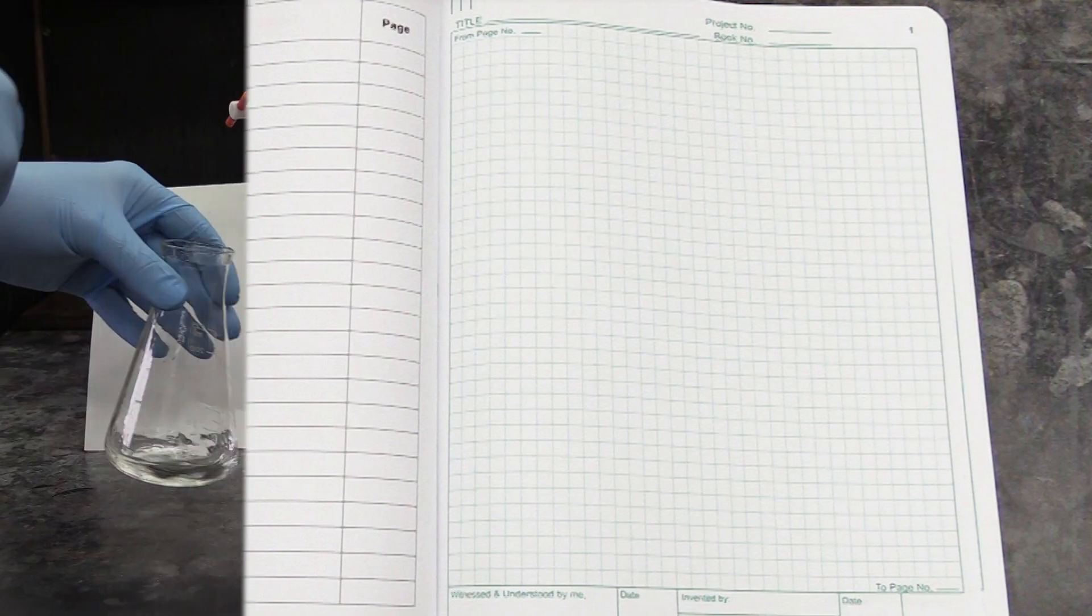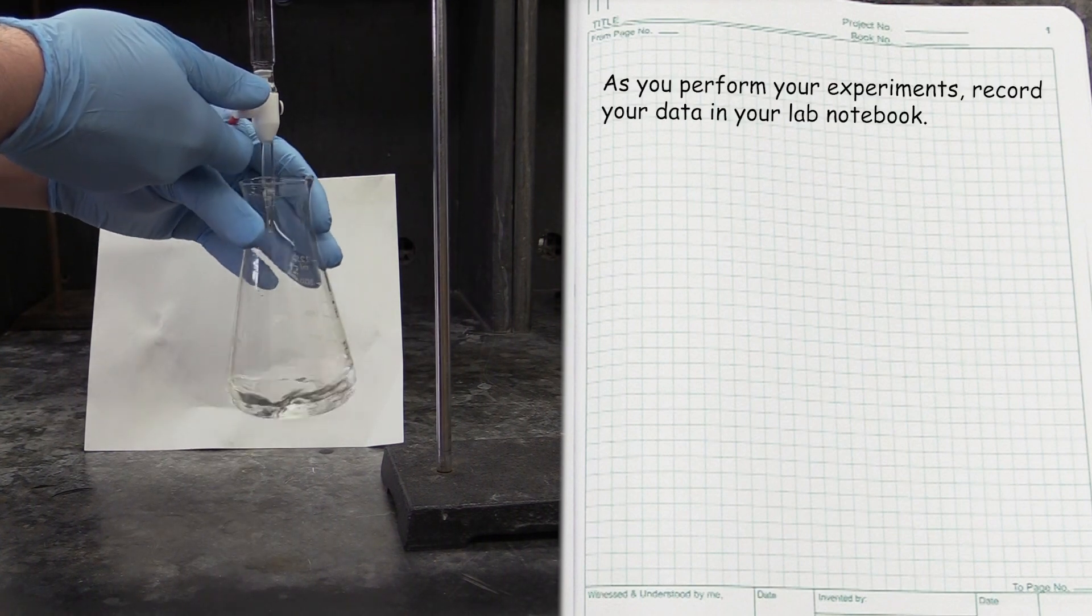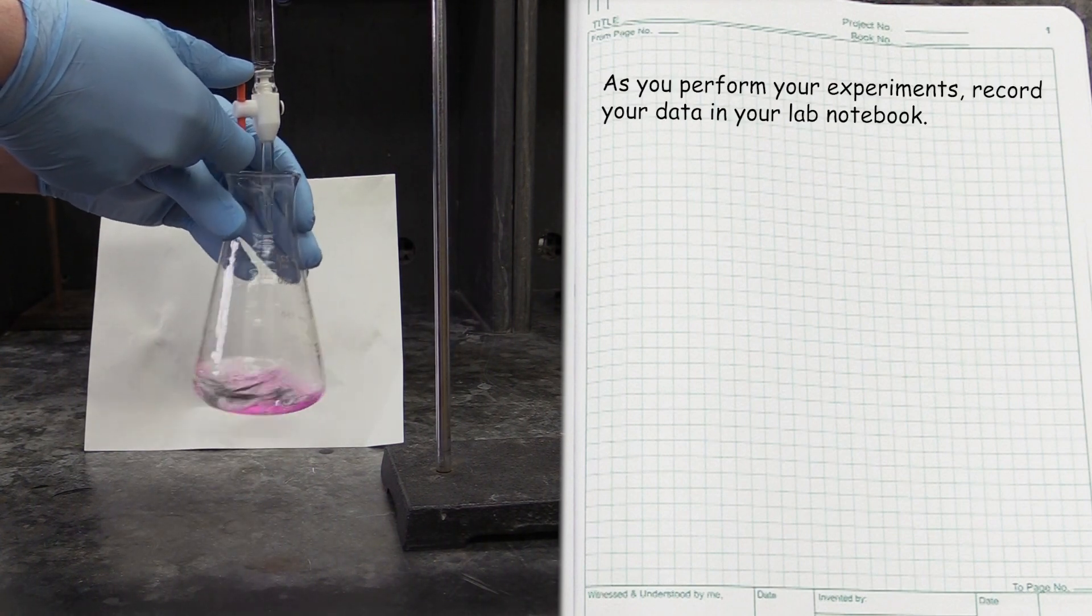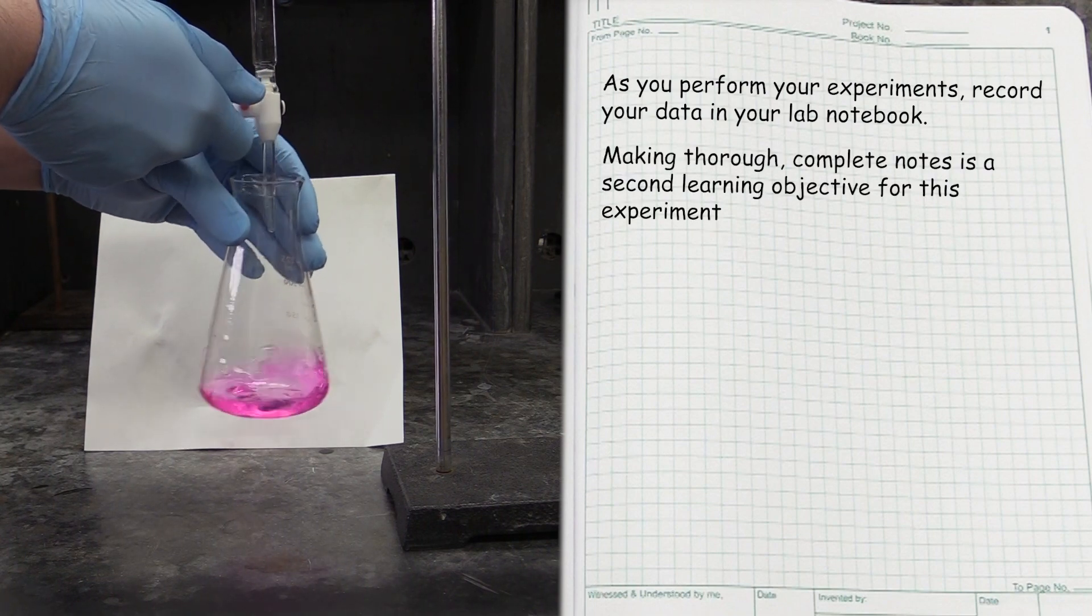Once your coat and goggles are on, it will be time to start your experiments. As you perform them, you will need to record your observations in your lab notebook. And this brings us to another of the learning objectives of this experiment, making thorough observations and taking complete notes.